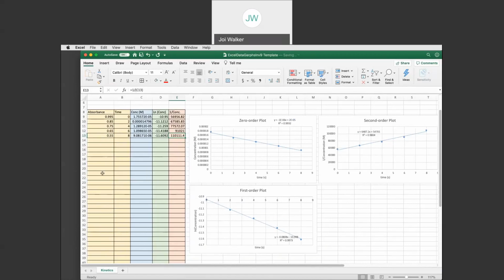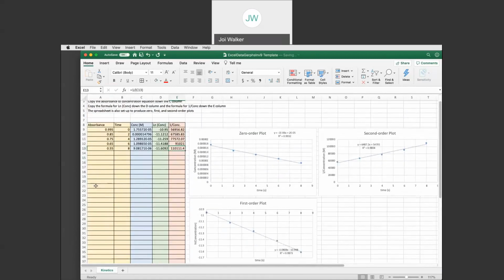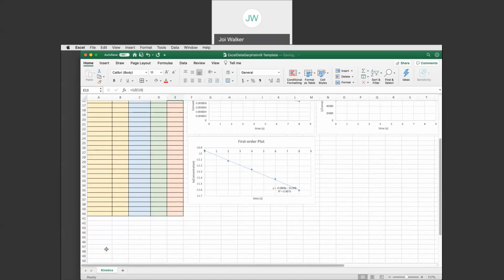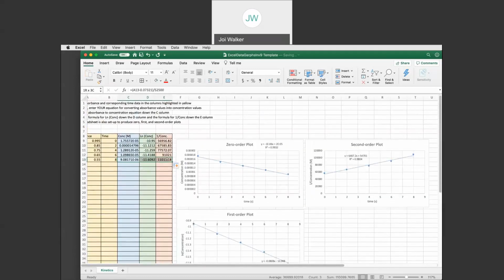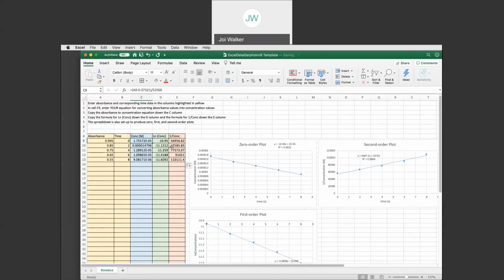But when you have your data, we've made about 38 cells here, that you can copy a whole bunch of your data down, and you could drag this all the way down and copy it down. So you don't have to calculate it. This is why Excel is so powerful. You can just enter the formula one time and then drag it down, and you could have 1,000 data points and calculate them all in 1 second.